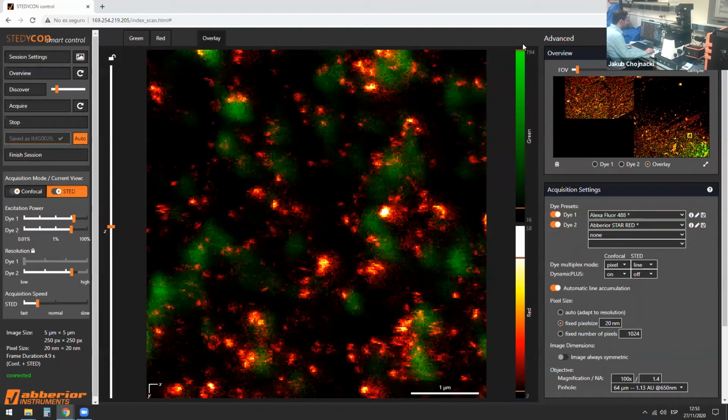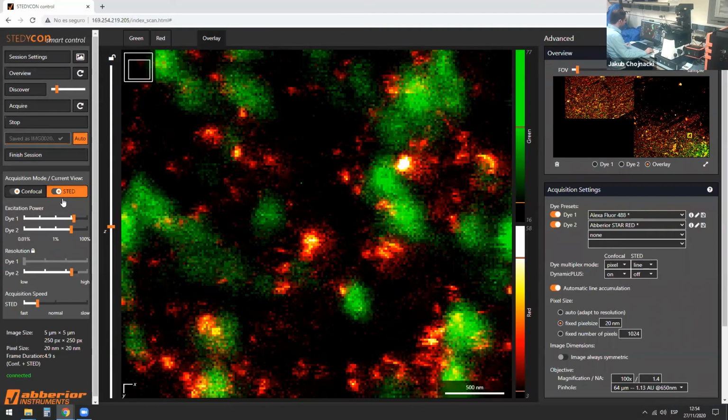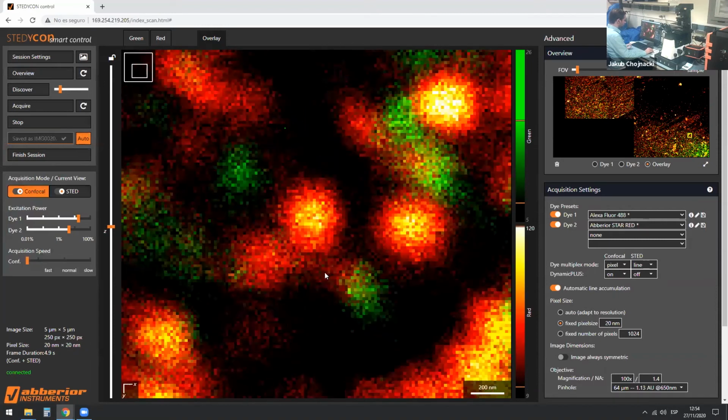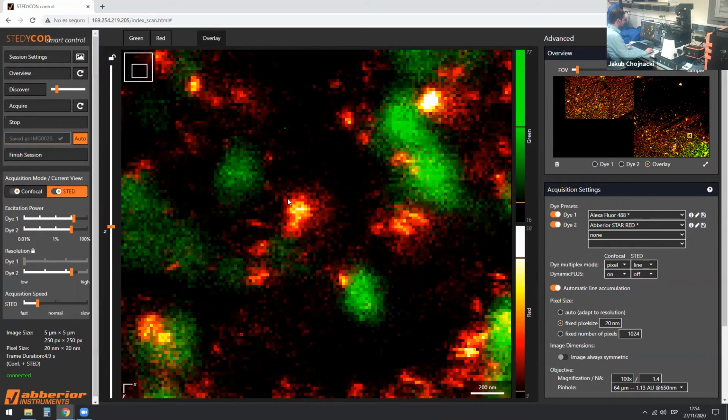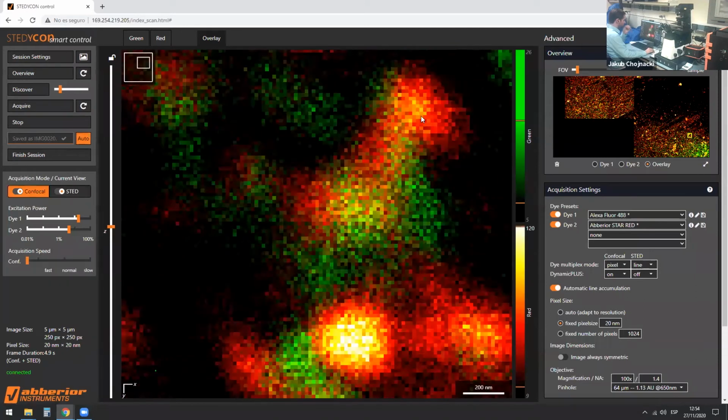Once again, I think we have an example of a semicircle here. There are probably one or two virus particles here. And over here, we have another example of a virus particle which has only a single cluster of envelope proteins on the surface. So let's compare those two. How does it look in confocal? Well, we just get a bit of a blob. And here we get this type of result. And for the semicircle in confocal, we also get a bit of a blob.